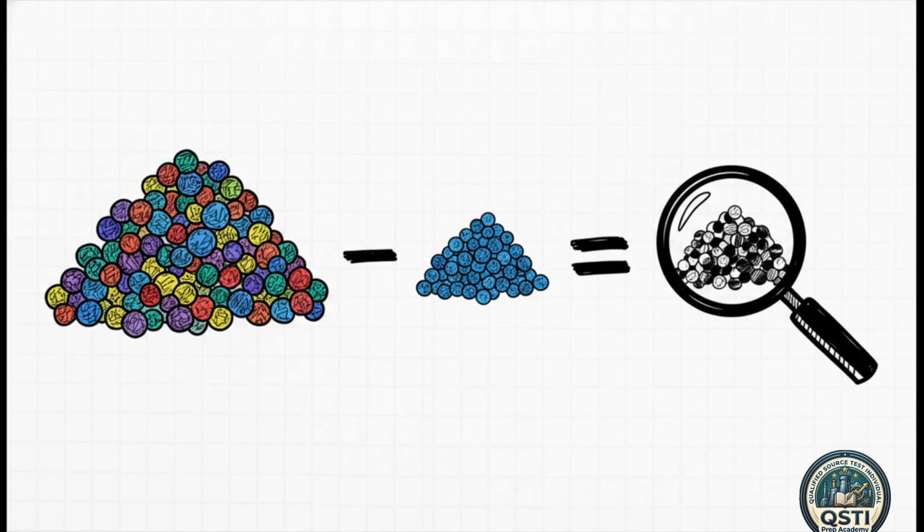All right, this is the climax of our explainer. This is exactly where all of that meticulous lab work, the endless 8-hour refluxing, and the precise chemical separations finally translate into hard, actionable regulatory data. Before we get into the complex formulas, just look at how beautifully simple the underlying logic of the entire method is. It's just subtraction by elimination.